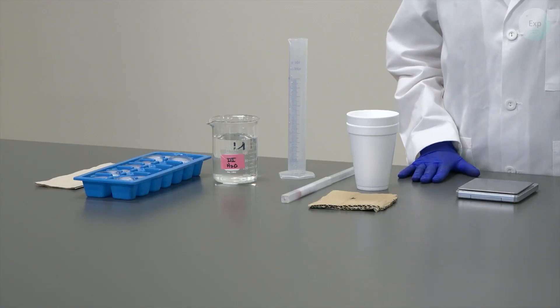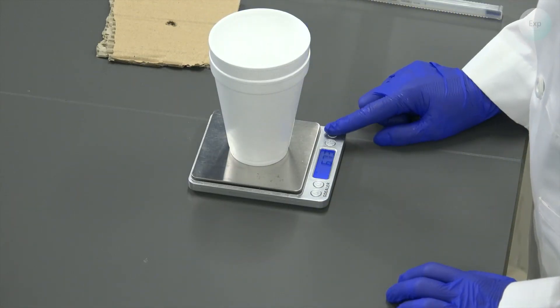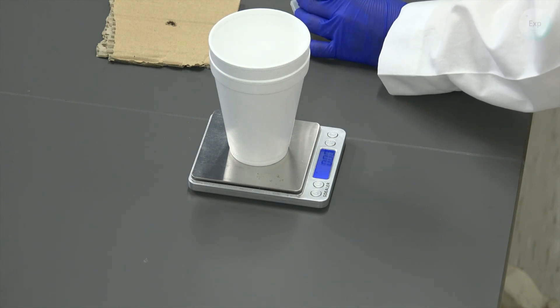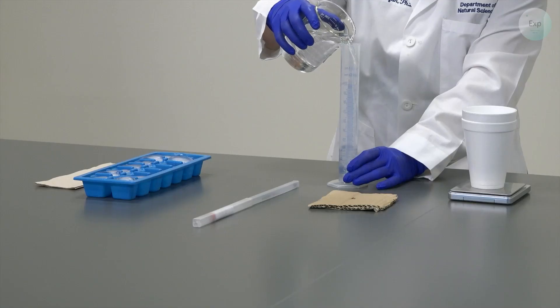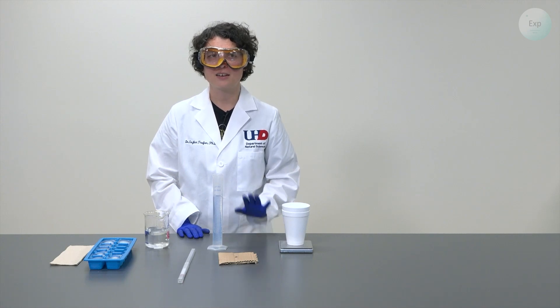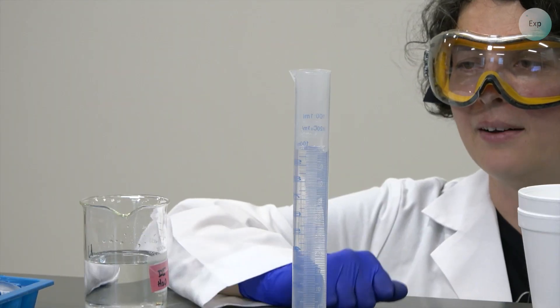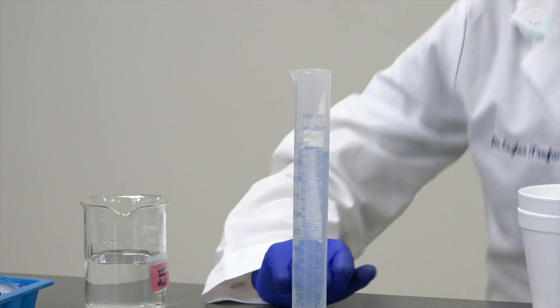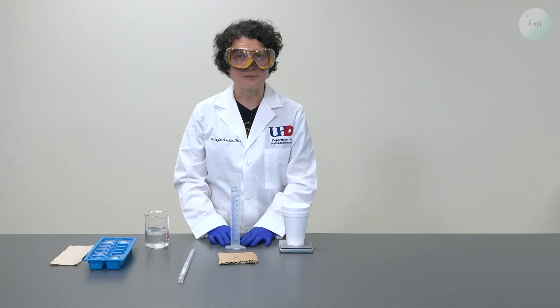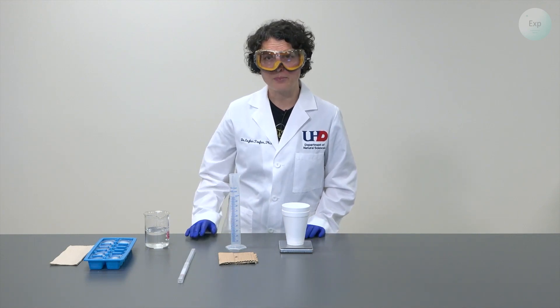Here we have all our materials for this experiment. Let's begin. First, we're going to turn on our scale, place our styrofoam cups on top, tare it, and transfer approximately 100 milliliters of deionized water using the graduated cylinder. We can record the volume, but the important thing is that we know the mass of our deionized water. In the graduated cylinder I have 99.9 milliliters of deionized water. I will transfer this into the styrofoam cup and add another approximately 50 milliliters of deionized water, for a total of approximately 150 milliliters of combined deionized water.